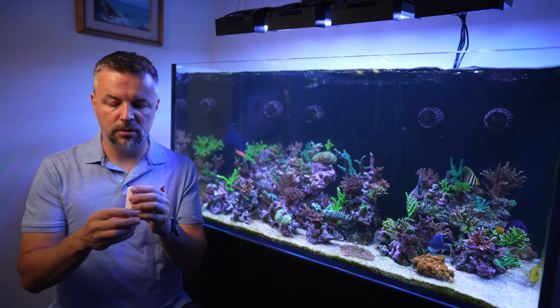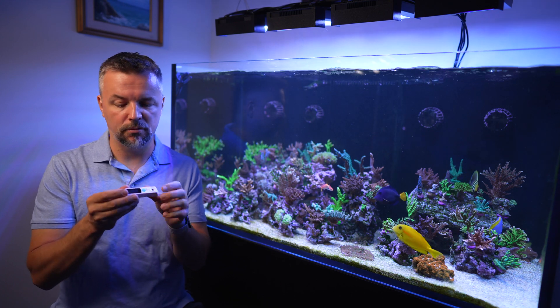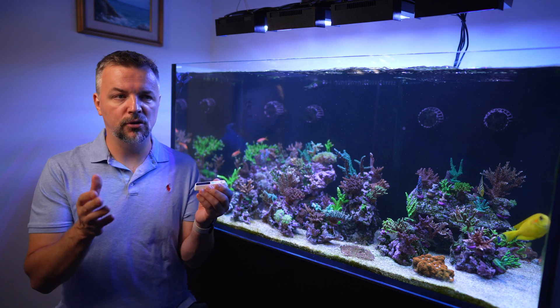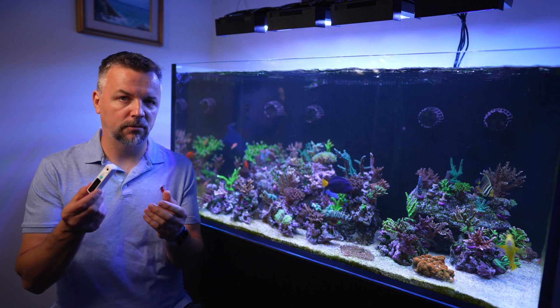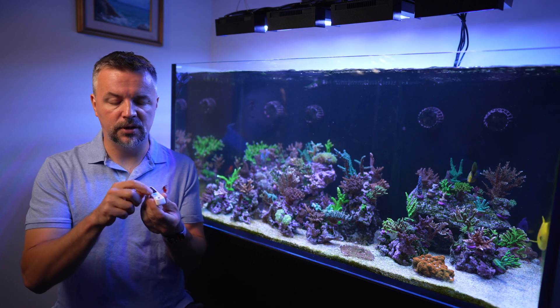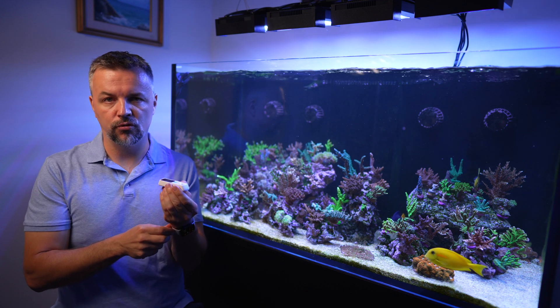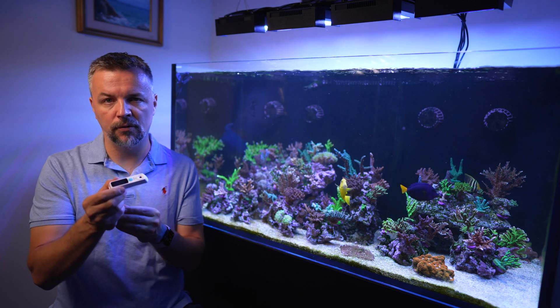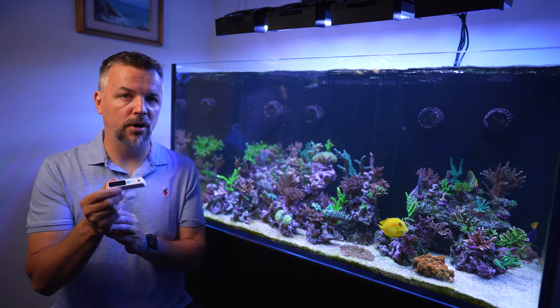It's a tiny unit. I'm really happy to see that you can charge it with USB-C — I think starting with 2021 all digital devices should be using USB-C for charging, and that comes from an Apple guy. It has just one button: you drop one drop of water, press the button, and it gives you a measurement. It also pairs with an iPhone app that we are going to take a look at.